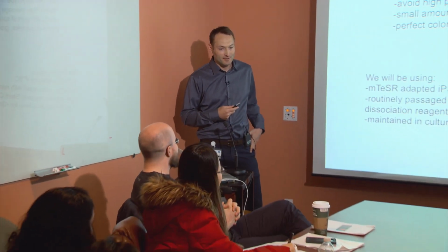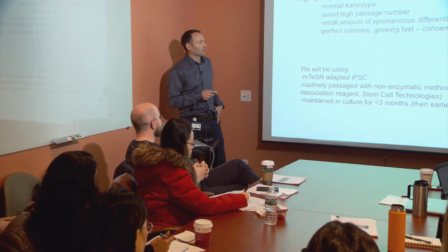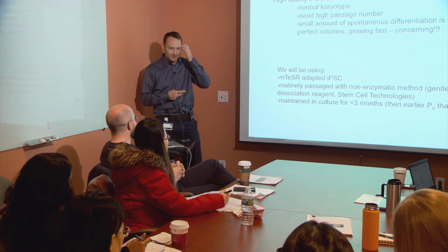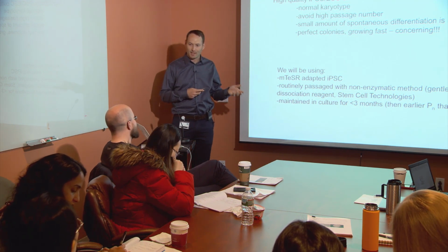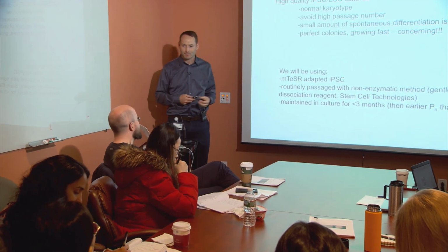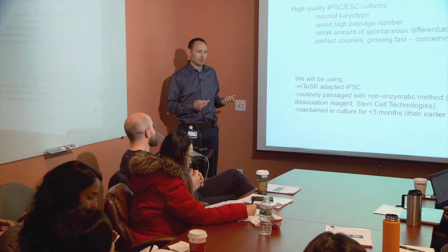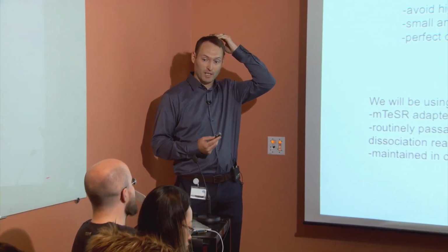That's very subjective. So for us, honestly, it's below 30. We are using a number of IPS cells now that have undergone gene editing, and usually with an additional antibiotic selection cassette excision, and that adds immediately 10 or 12 passage numbers before you can use it. But you'll notice from some of the embryonic stem cell lines that are out there, like H1 and H9, many of those now are up to passage 80 or 90 or higher.